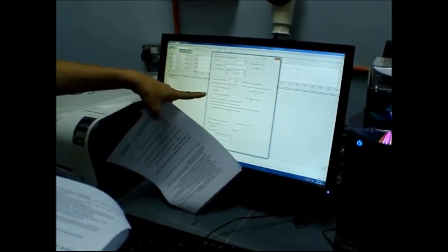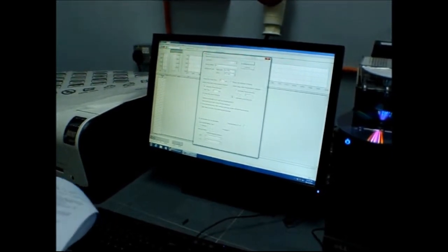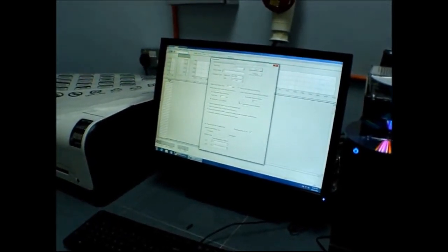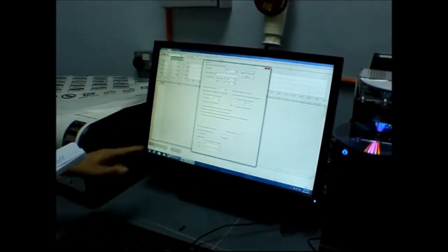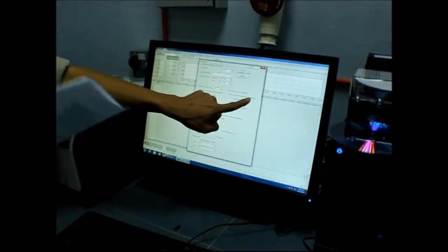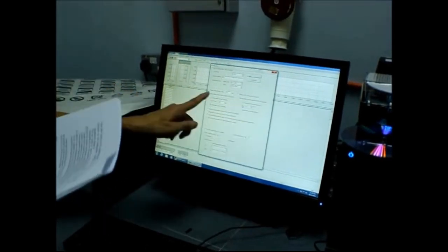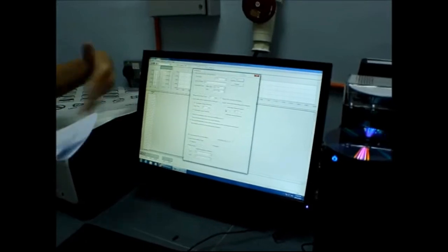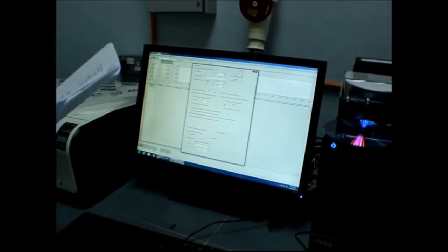Okay, requirement, if you want to check, this one also can. That means your lamp will automatically shut down after that. When it's finished, stop. Maybe for this one, action when measurement is stop, maybe you need to run again, so you better don't check this one. We check this one so after finish, the flame goes out, then the lamp off. Okay, so the rest no need.